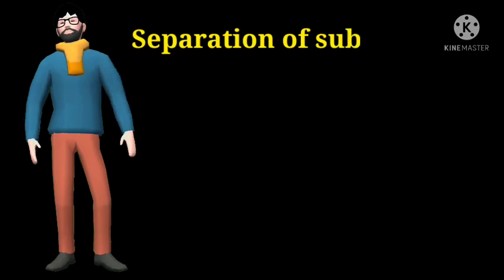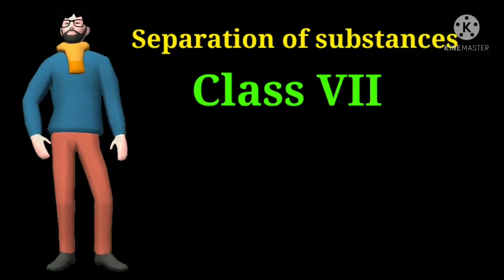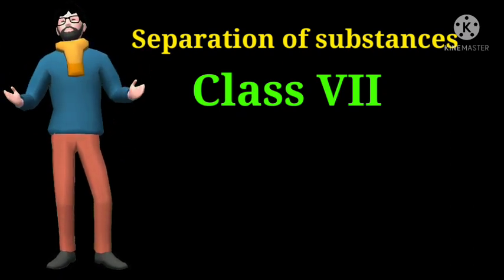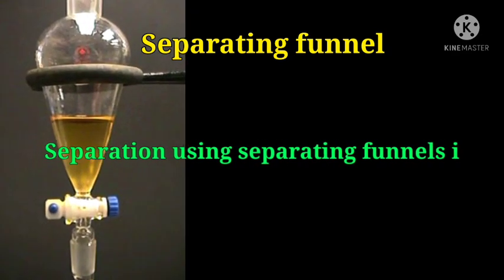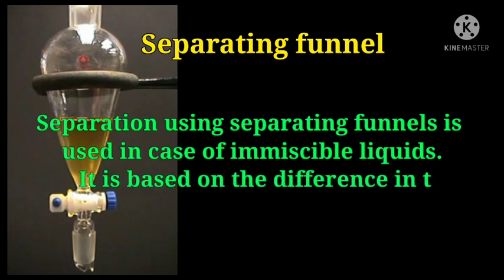Today we are going to start separation of substances. In a previous lecture, we discussed chromatography, and in this lecture we will talk about separation of substances by using a separating funnel. A separating funnel is used in the case of immiscible liquids.